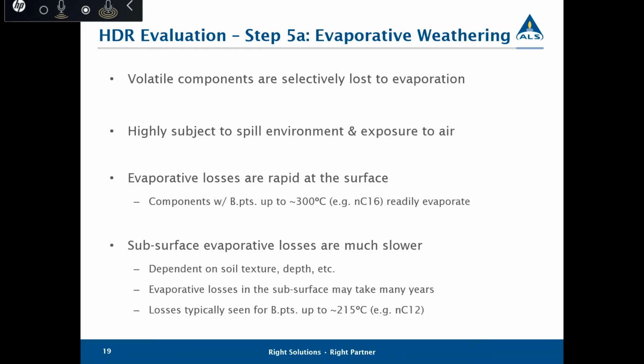Moving to the first weathering process, which we call evaporative weathering. As your sample is exposed to the air, the evaporation process selectively removes the volatile compounds.